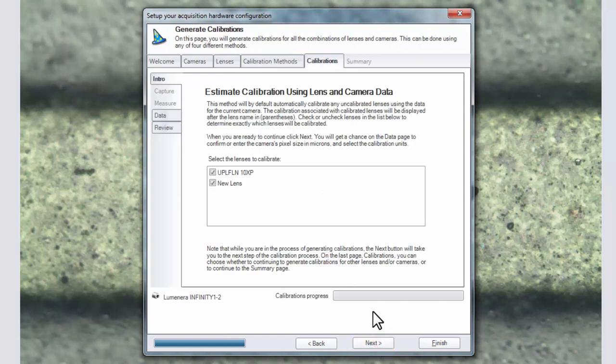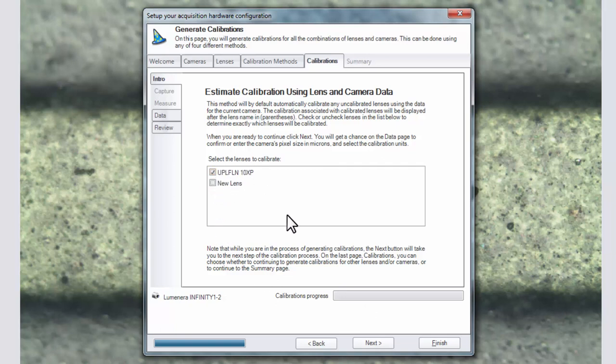Here you can read about how the procedure will work and then confirm the lens that you wish to calibrate. We will calibrate our 10x objective and click next.